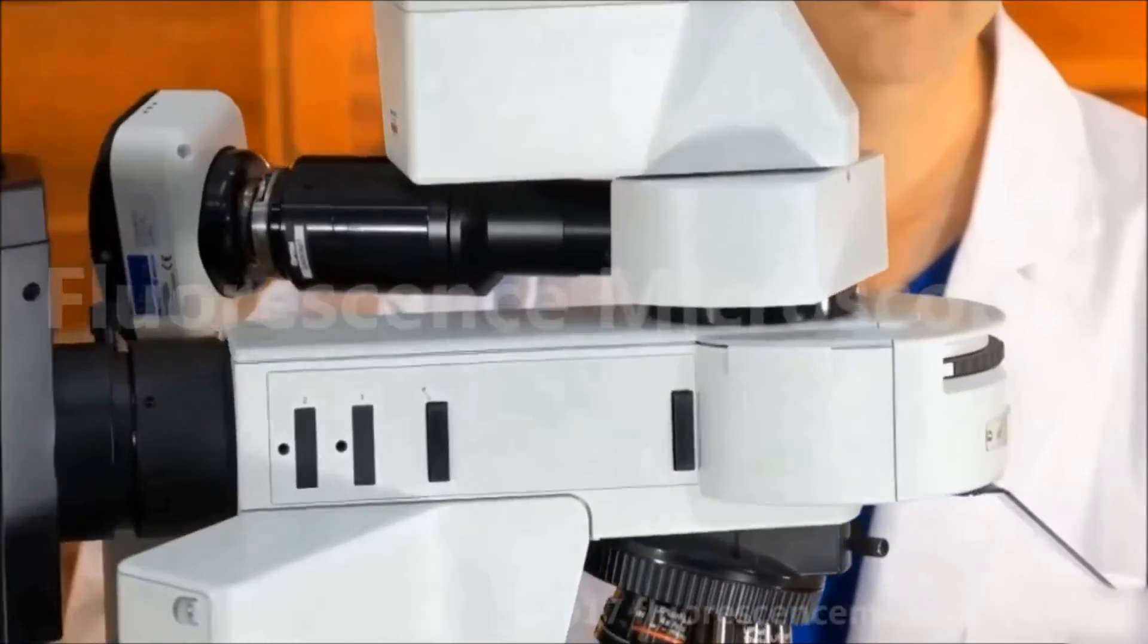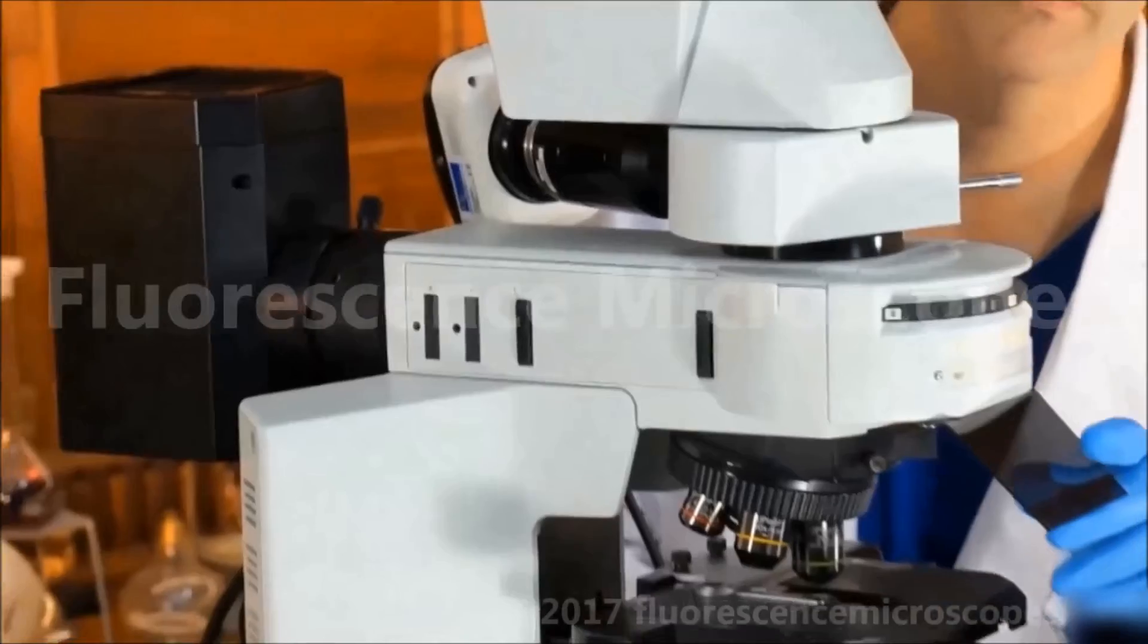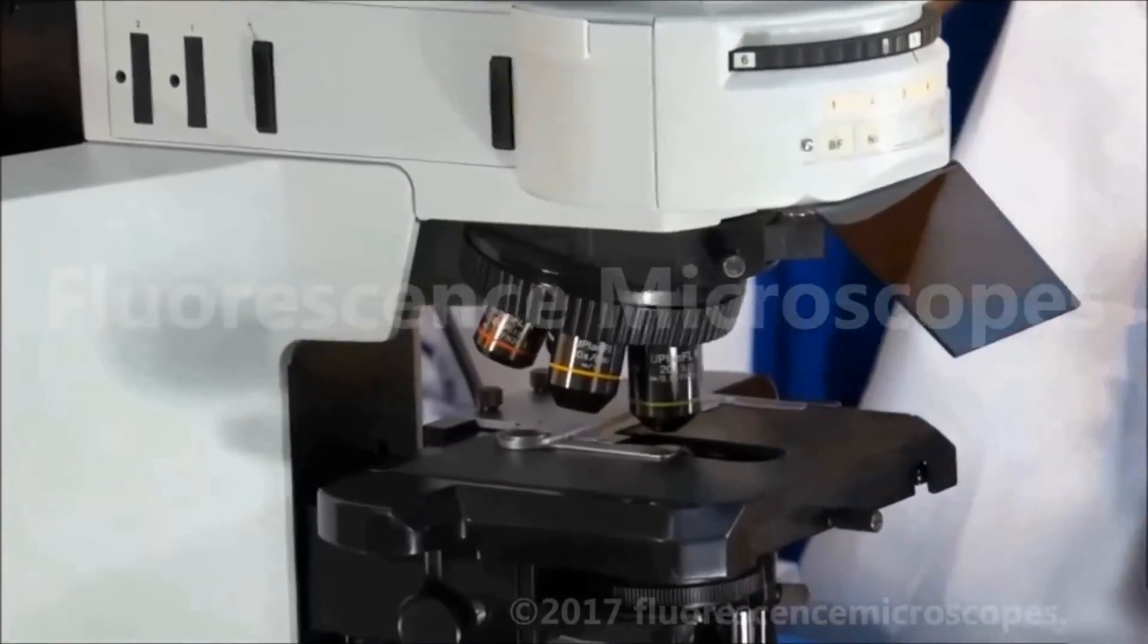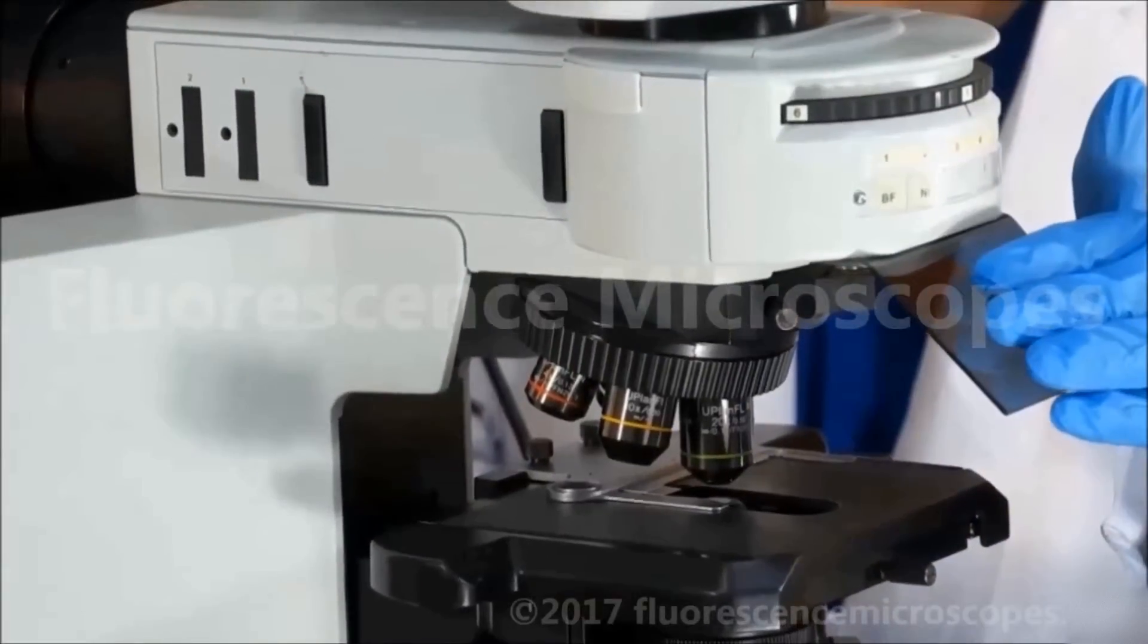We're also showing a UV filter. This protects from UV light reflecting it onto your eyes.